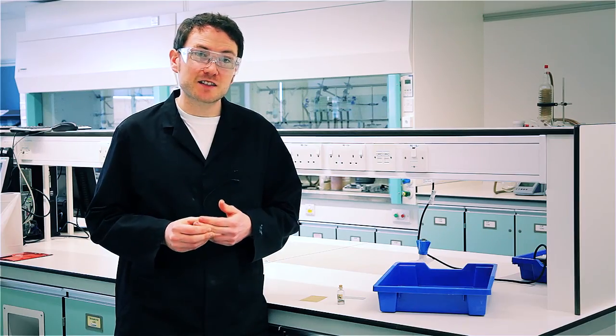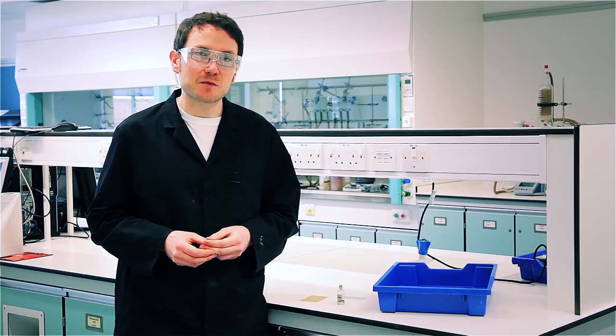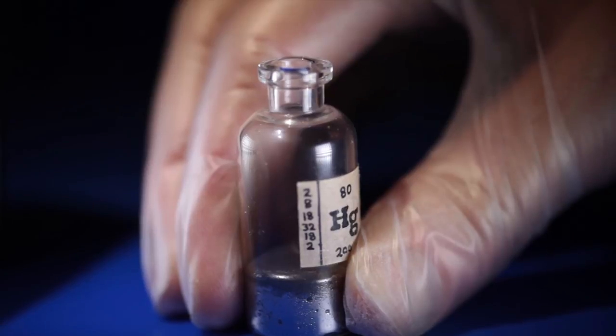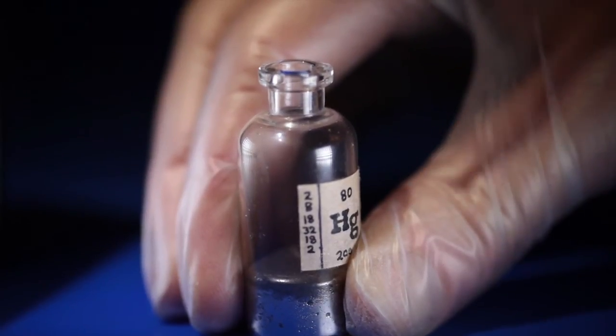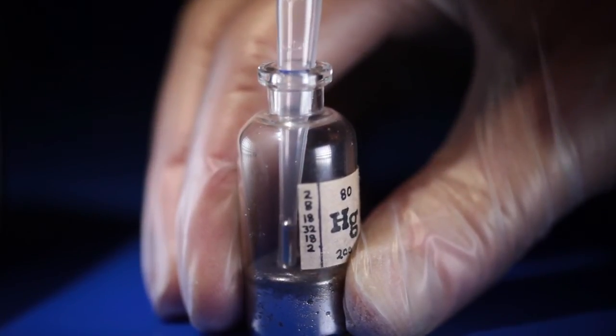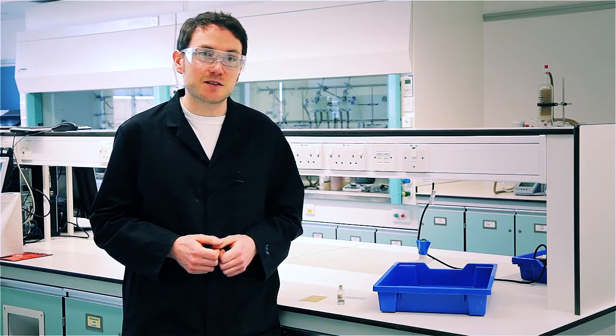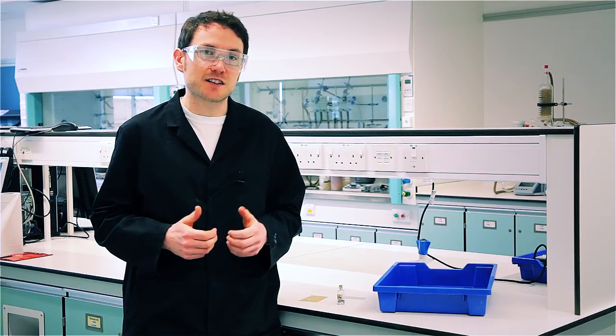Remove any rings, pop on some gloves, and you're ready to show what happens when mercury meets gold. Take care when handling the mercury — it just loves to drip out of a pipette. I try to leave a little bit of air behind it. A flexi-cam might help larger classes to see what's going on, especially if you're only using a drop here.